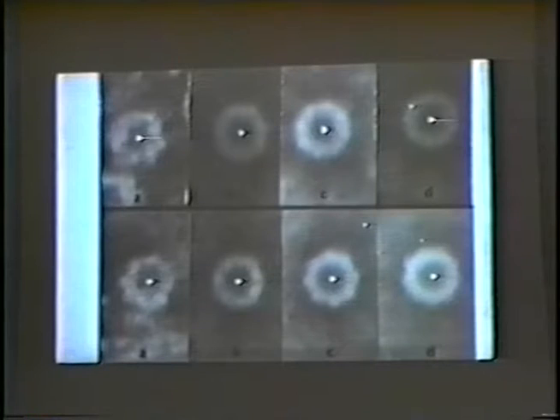This is open to question. Work from the laboratory of Wolfgang Baumeister indicates 6 or possibly 7-fold rotational symmetry, but we have here a very complex molecule, as indicated by the model. It is my belief that in all probability the central rings do not have the same symmetry as the outer rings of the stacked subunit composition.